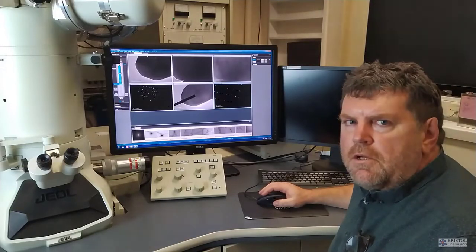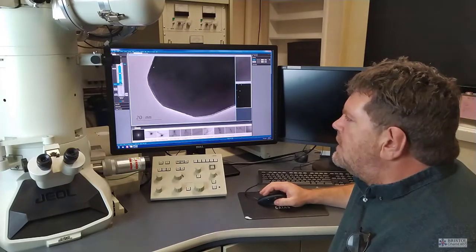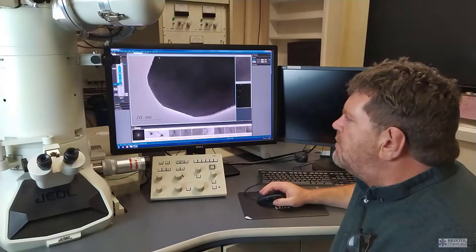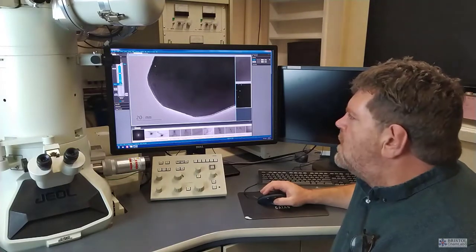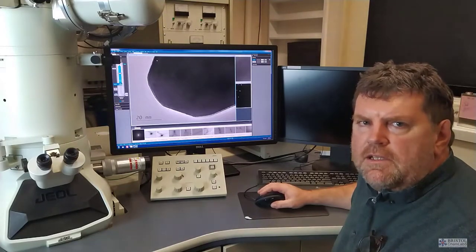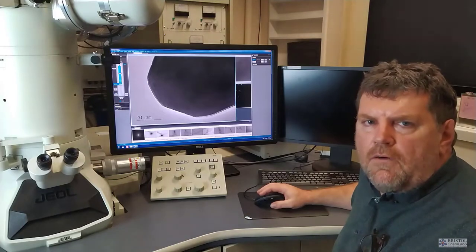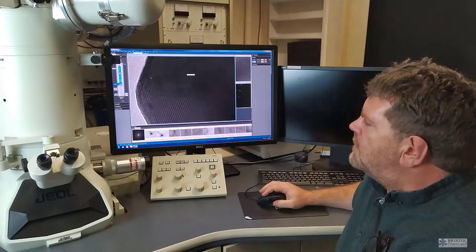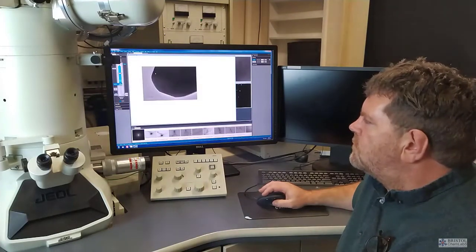The images produced by the transmission electron microscope show us the internal structure of materials. For crystalline inorganic materials, we're interested in the crystallography, the arrangements of atoms and the composition. We can use the X-ray analysis to tell us that chemical composition, and we can also do diffraction and high resolution images to actually see the crystallographic arrangement of ions within a lattice. This sample is a sample of a superconductor being produced by one of the research groups within the department, who are interested in controlling the morphology of the particles and trying to produce long anisotropic or not cubic particles of superconductor. When we zoom in on this material, we can actually start seeing the arrangement of the individual ions and atoms within the lattice structure of the material.